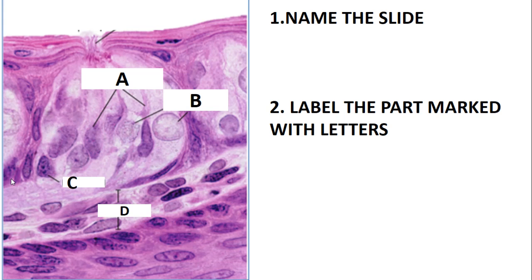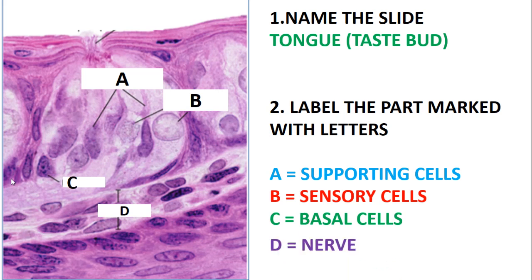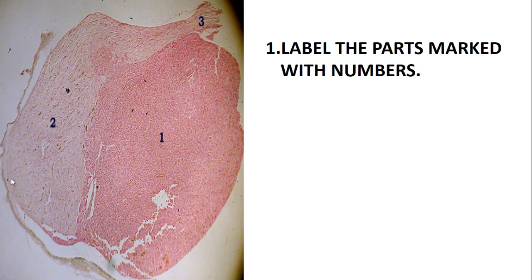This slide is from the tongue and we are focused on the taste part. In part 1 of system histology I explained features such as the gustatory receptor cells found in the taste buds, but this time we are looking in a bit more detail at other content found in the taste part. Label the parts marked with letters: A is the supporting cells, B is the sensory cells, C is the basal cells, and D is the nerve.